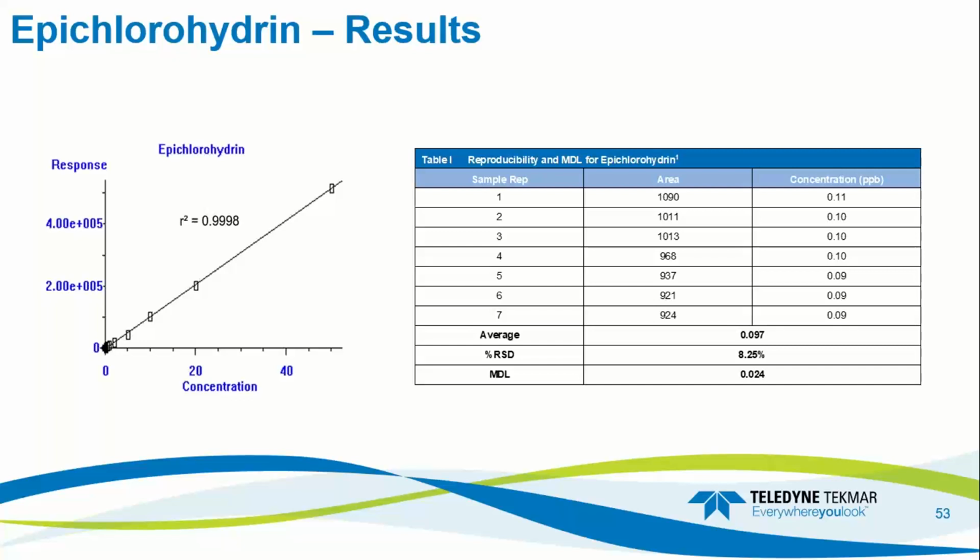To demonstrate the robustness of this method, 21 ppb check standards were also analyzed 5 days after the initial calibration curve was performed, and the average response of these check standards resulted in a 98% recovery from the original calibration value.